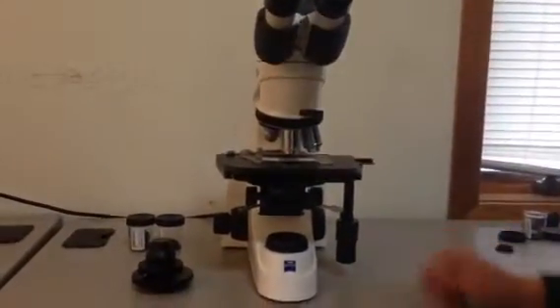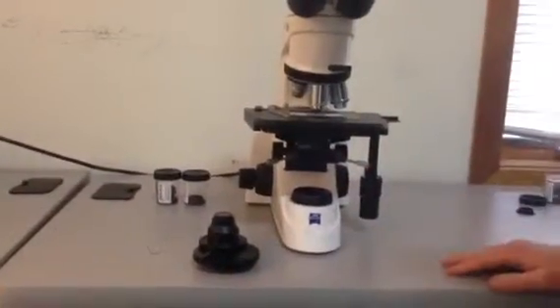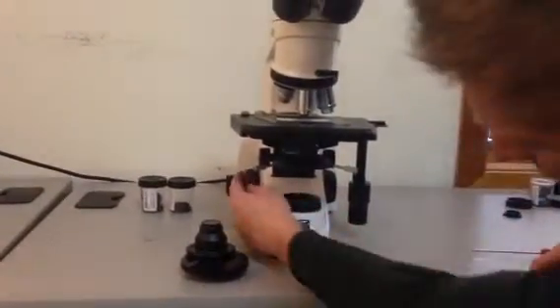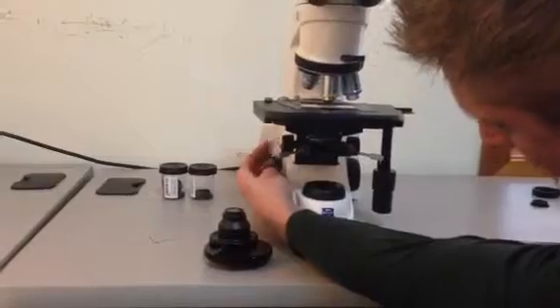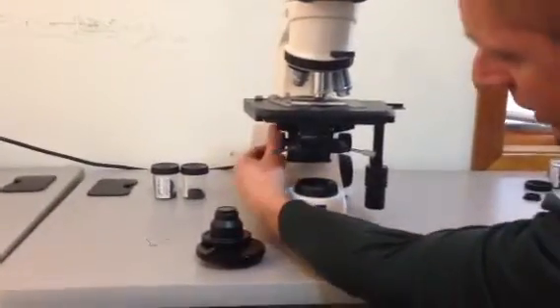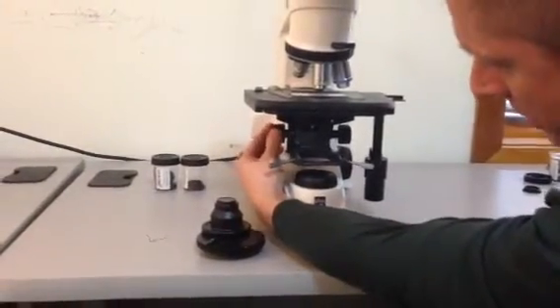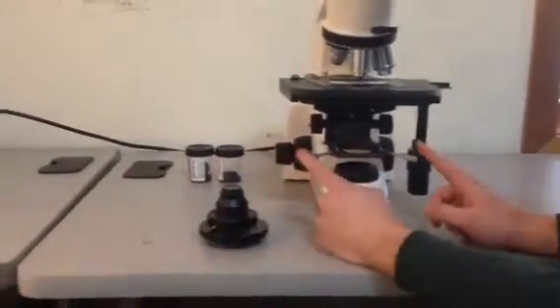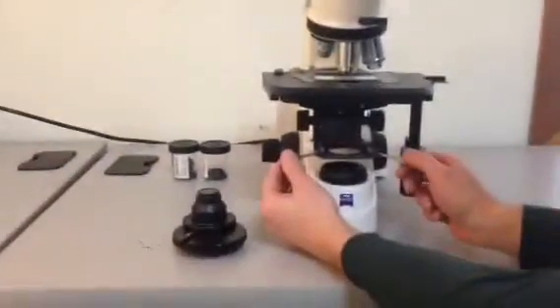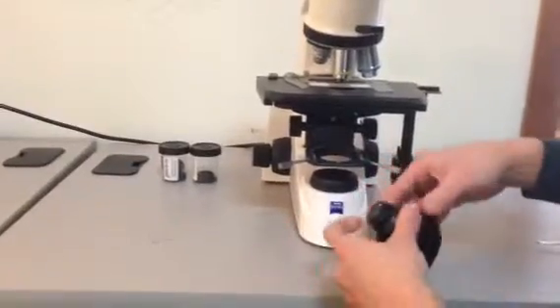The last part — and the trickier part — is mounting the condenser onto the microscope. To do this, look for these knobs back here. Not the microscope focus knobs, but the condenser focus knobs. Drop down the condenser holder and make sure these two screws are backed all the way out.